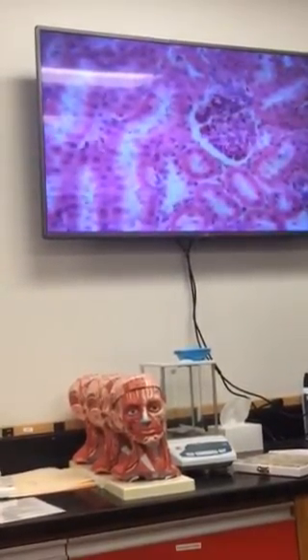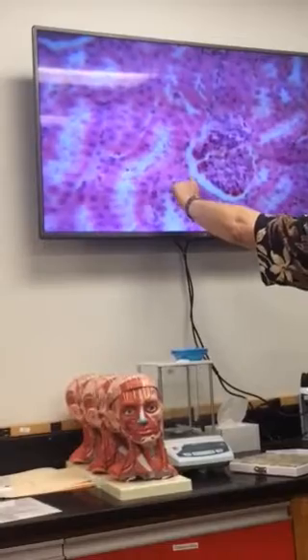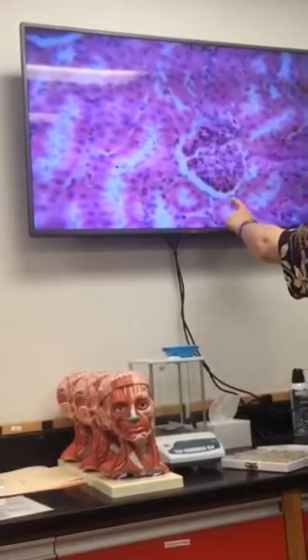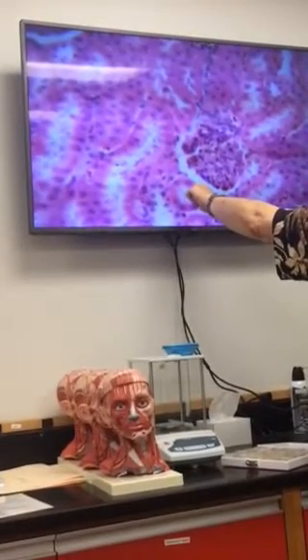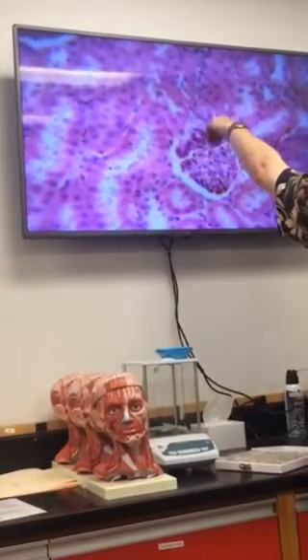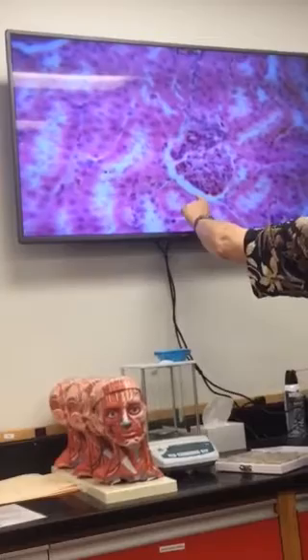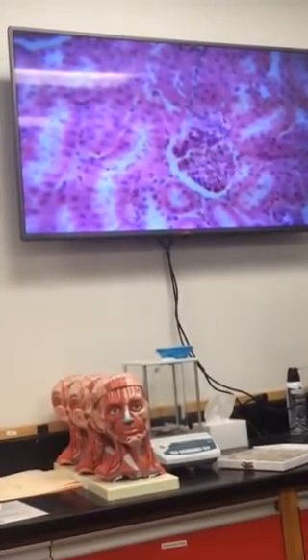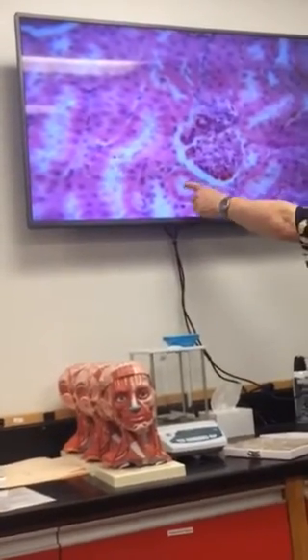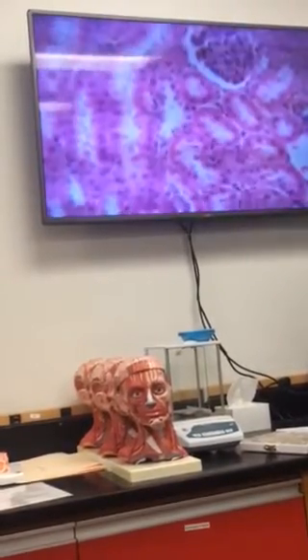There you go. So right there, you're actually seeing the glomerulus, and then a simple squamous epithelia that encases the glomerulus. What is that? That would be called Bowman's capsule or the glomerular capsule. And as blood pressure forces a fluid across the wall from the plasma, we call that fluid that accumulates here a filtrate. So filtration is the first step in making urine. Okay. And then it passes down through the inside of these tubes that you can see right there. This part of the renal tube.